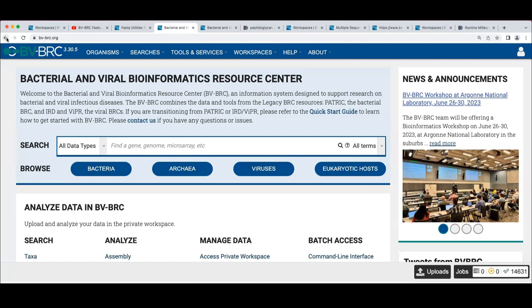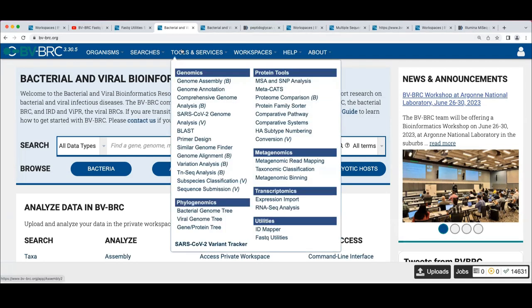The annotation of the proteins is the way that we compare similar things, and you'll see that whenever we assemble and annotate genomes here. My demonstration is specifically for the comprehensive genome analysis service, which is a meta-service that encompasses assembly and annotation. Under the tools and services tab, you'll see genome assembly and genome annotation — those are the two sub-services for comprehensive genome analysis.